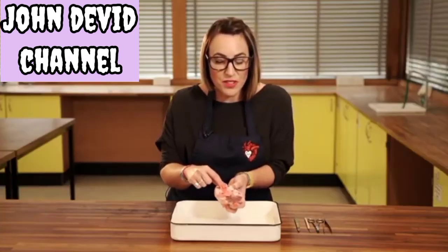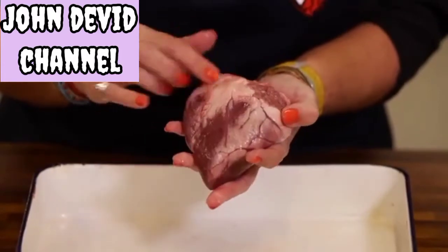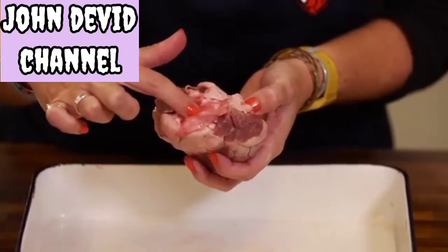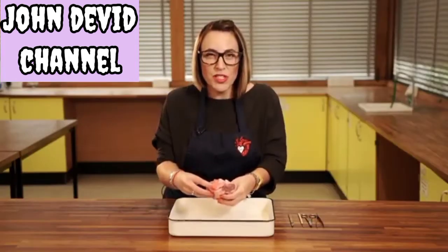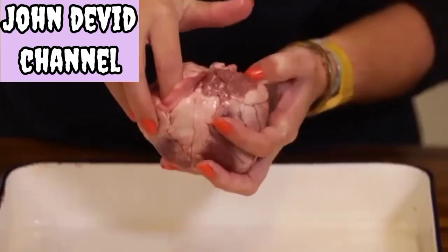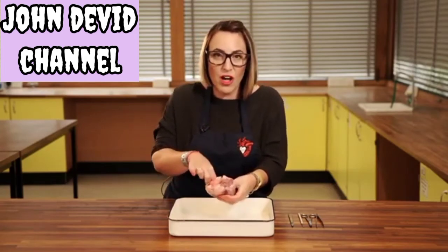The aorta is an artery so it pumps blood under high pressure — it's the thickest vessel and has to pump blood all the way around the body. You've also got another artery: the pulmonary artery. There are also coronary arteries covering the entire surface of the heart, and these arteries bring blood carrying oxygen and glucose to the heart muscle itself. This slightly thinner blood vessel on the top of the heart is our vena cava. When your body needs oxygen, blood enters the heart through the vena cava and goes down into our right atrium.